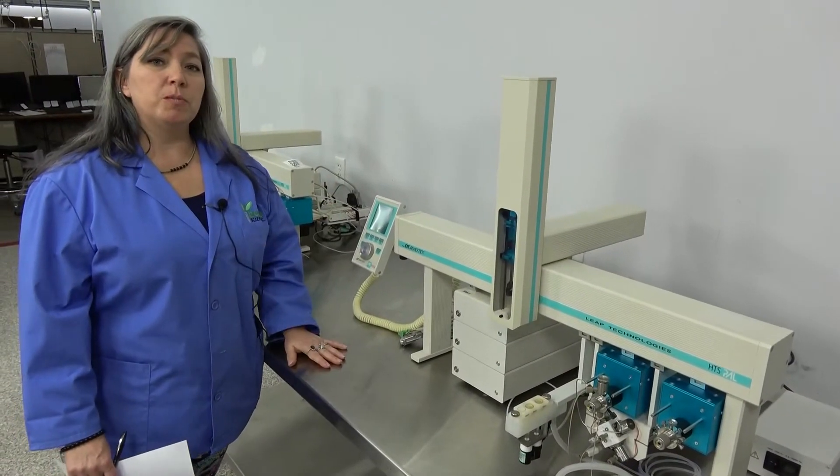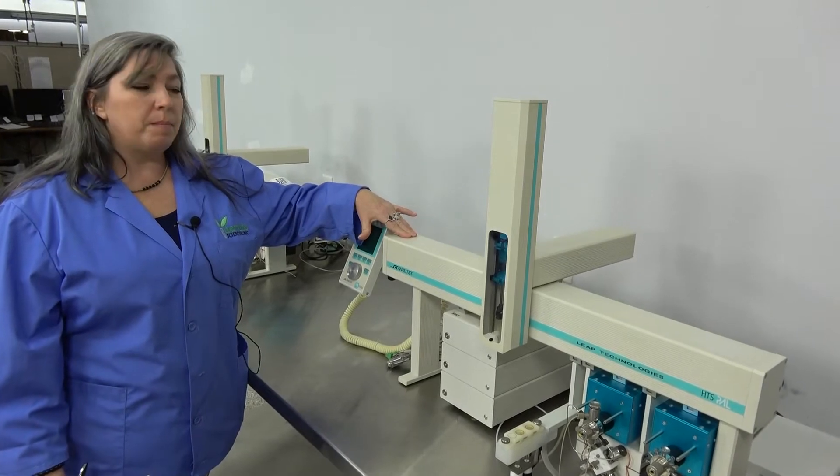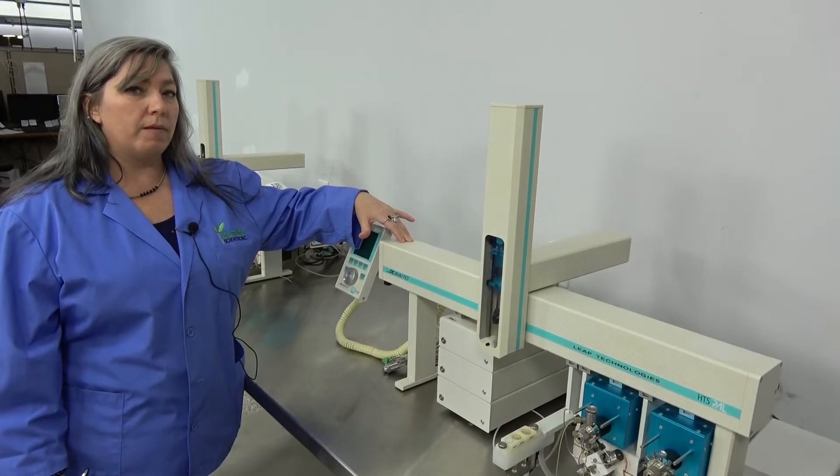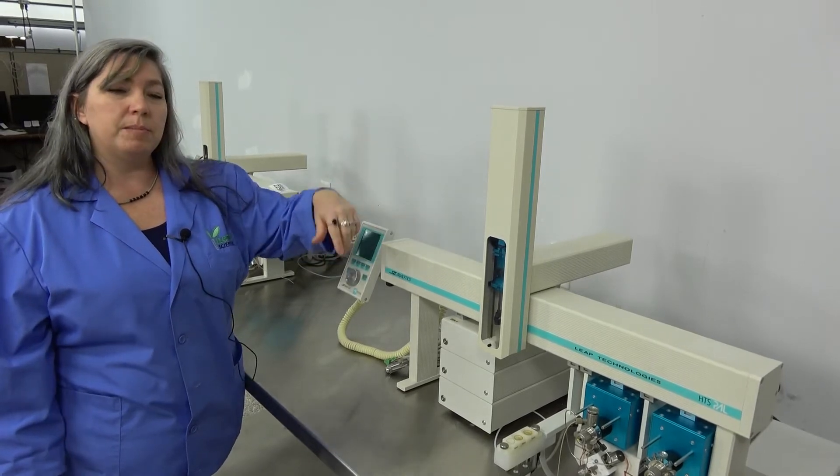Hi, I'm Lori and I'm coming to you from New Life Scientific. Today we're going to show you one of the PAL liquid handler systems that we have on hand. These are made by CTC Analytics and they're distributed by Leap Technologies.